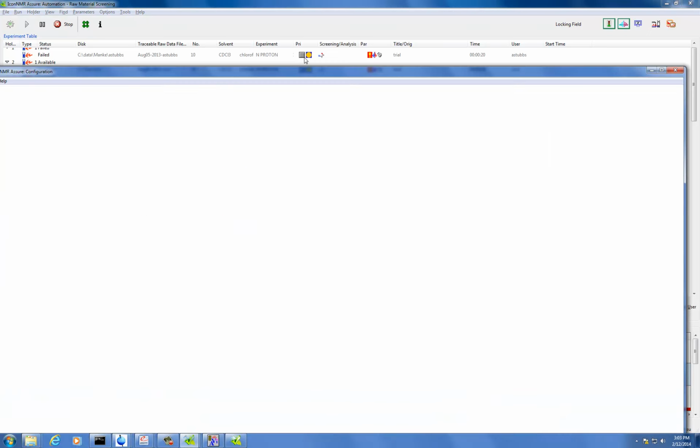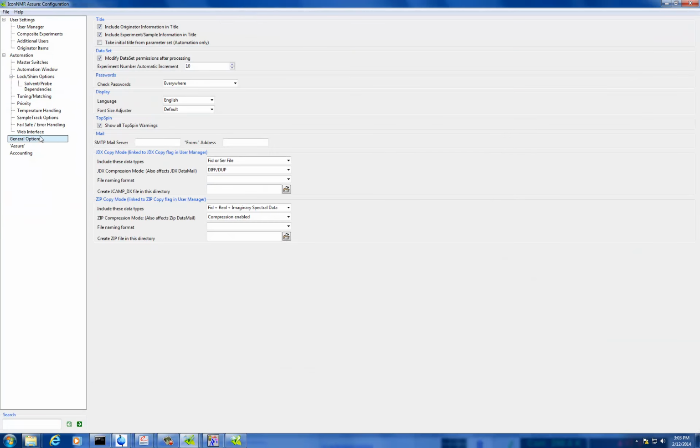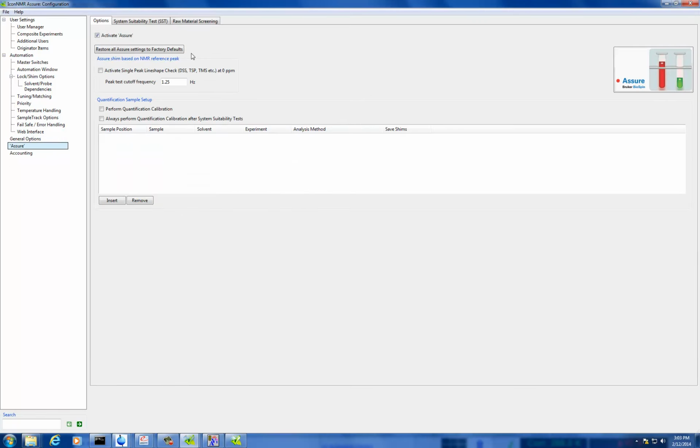Are we gonna have to enter the password in order to do that stuff? Yes. Yeah. I think it's important to have it, I guess.